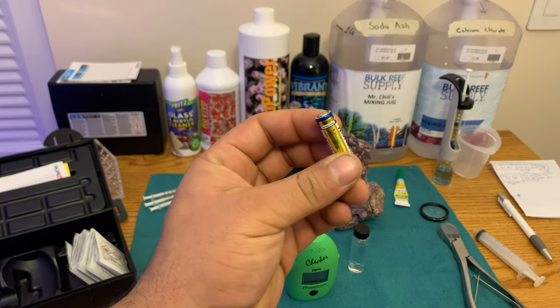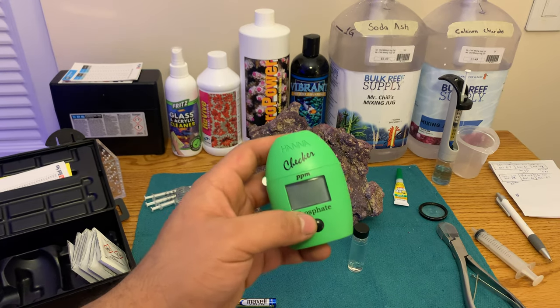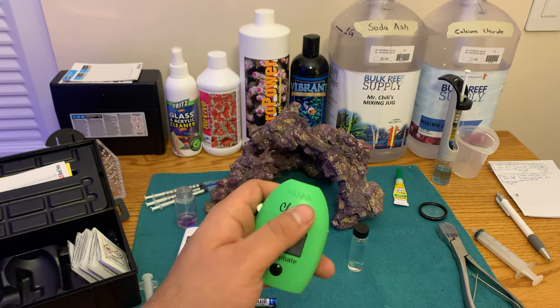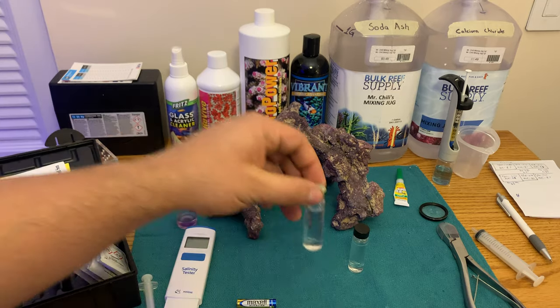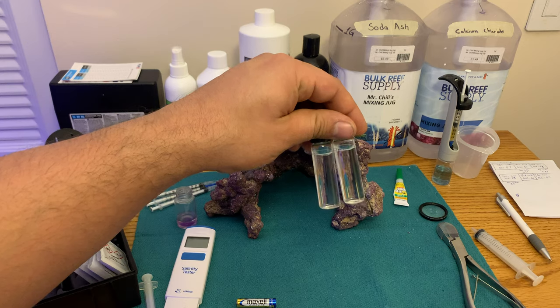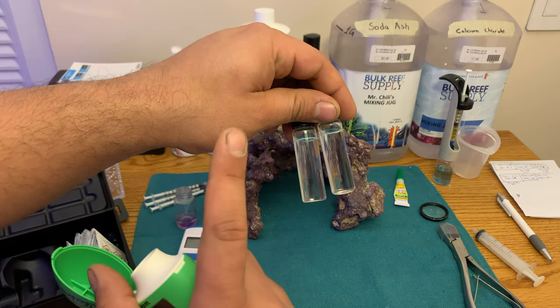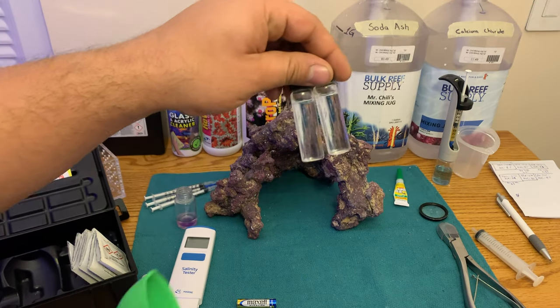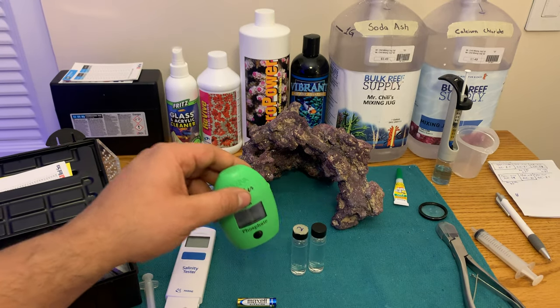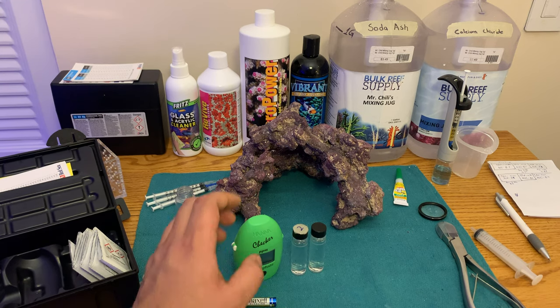Come to find out, I took the battery out, put a new one in the phosphate checker, started it back up, and it said I had 0.08 phosphates. And as you can see, I used the same water, the same test solution, and the same control, and I did the test over with the new battery and it tested a different value than before.